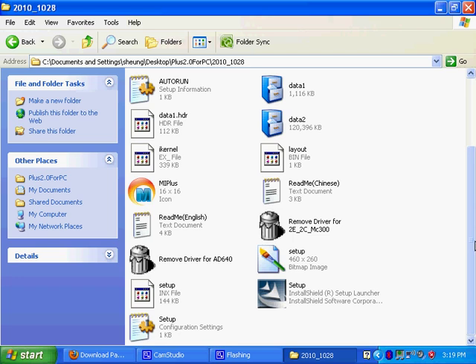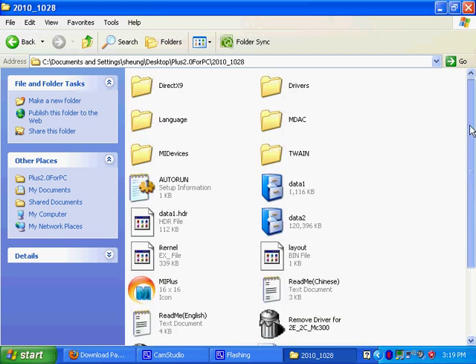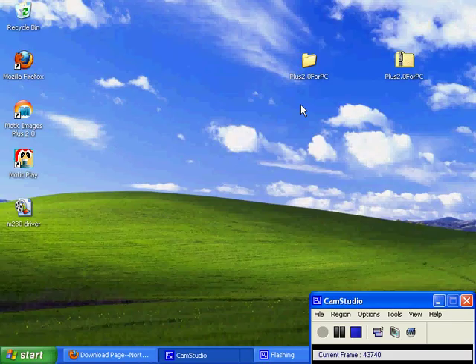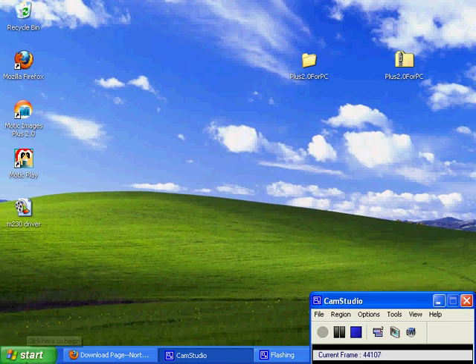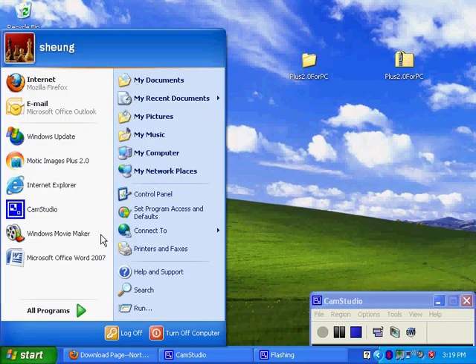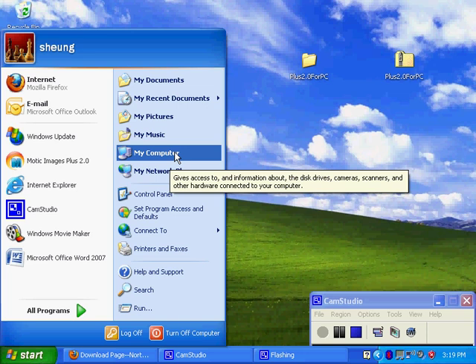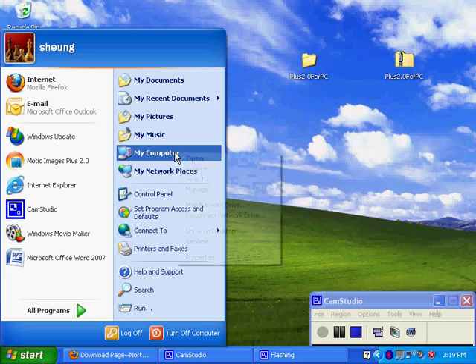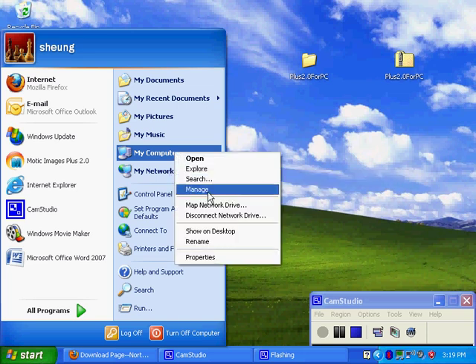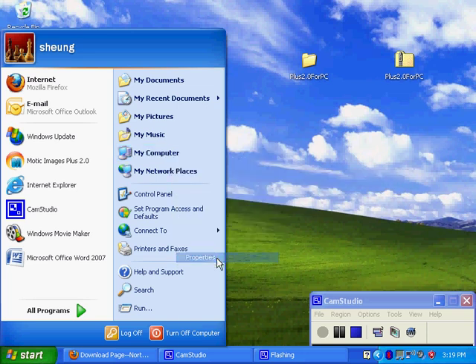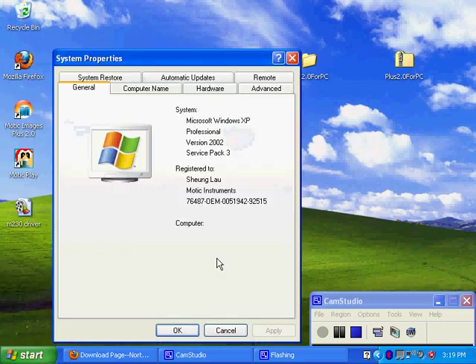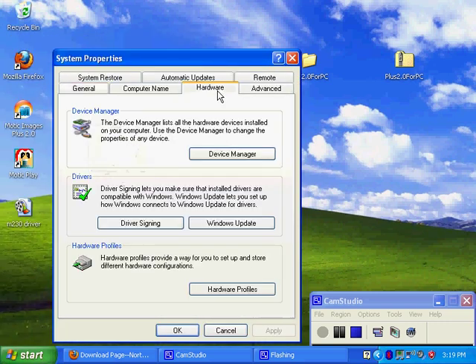Once you've done that, then you can move on to installing driver, which is inside this folder, but we don't do it from here. What I need you to do is click start, and then right click on my computer, and then click on properties, and then go to the hardware tab, and then click on device manager.